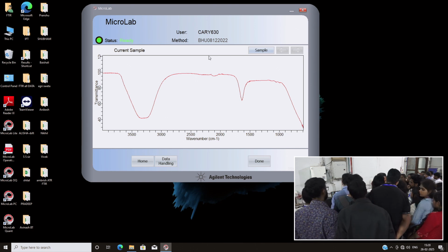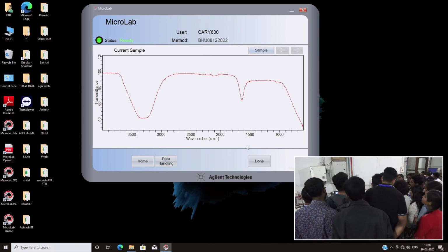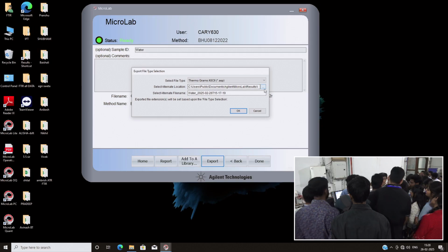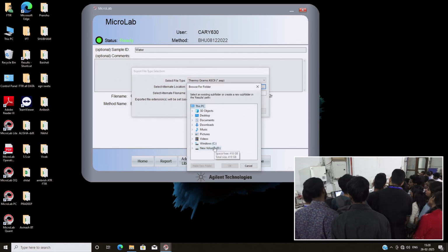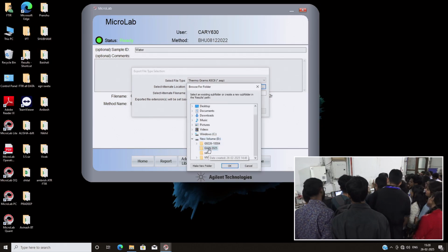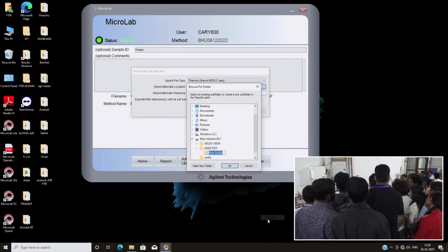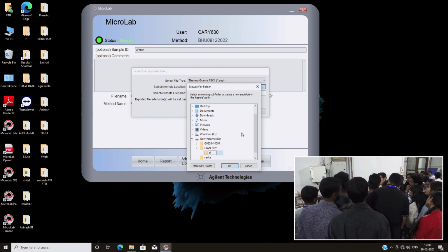Accordingly, they form some unit structure, and here 5 H2O forms one unit. Then the vibration mode of the 5-unit is detected here. One of the unit vibrations appears at 2200 wave number. So that is characteristic to liquid water.